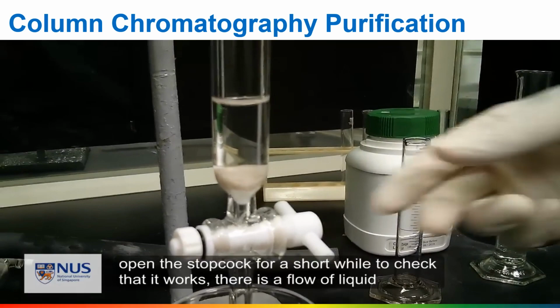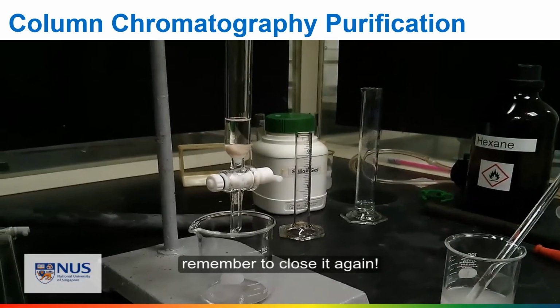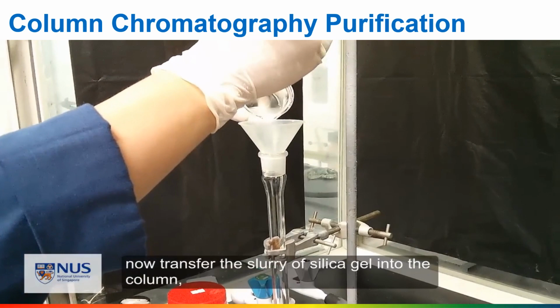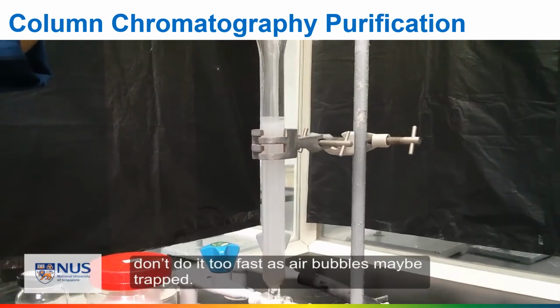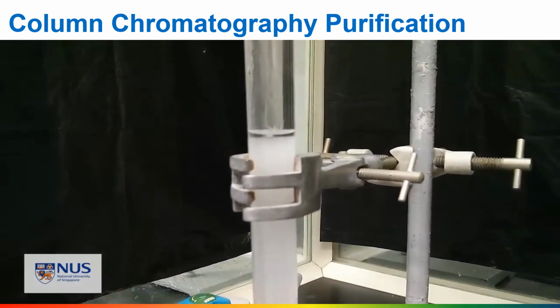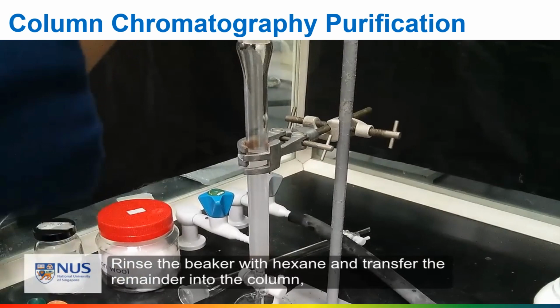Open the stopcock for a short while to check that it works. And now transfer the slurry of silica gel into the column. Be calm and stoic. Don't do it too fast as air bubbles may be trapped. Open the stopcock to allow the silica to settle. Rinse the beaker with hexane and transfer the remainder into the column.